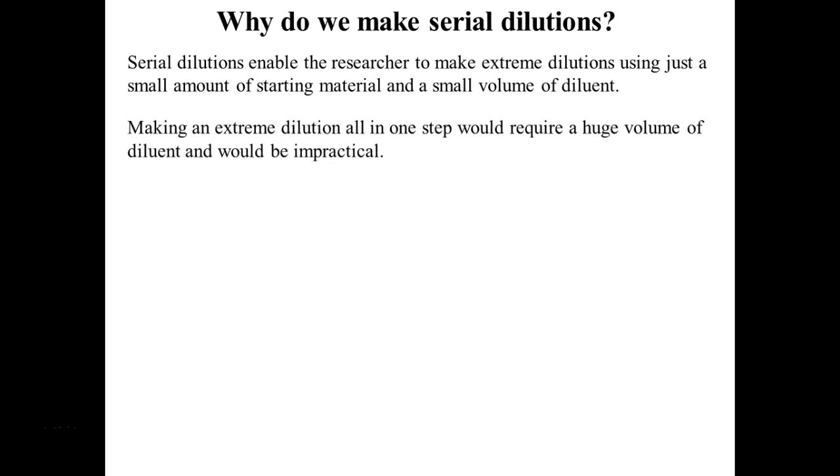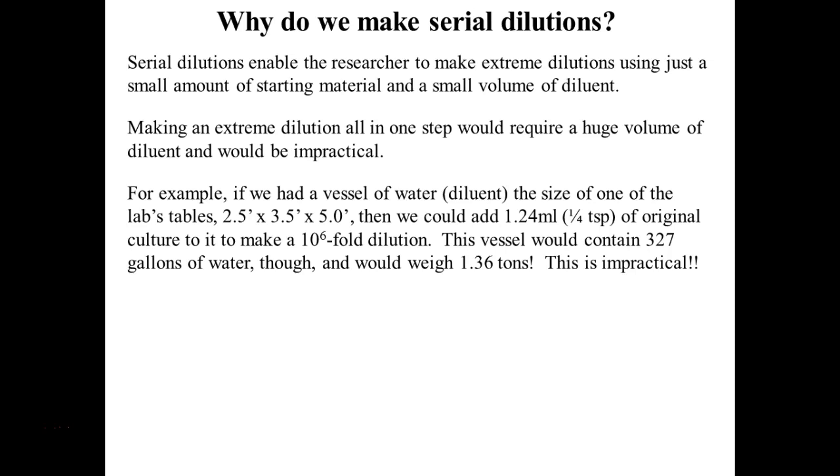So why do we make serial dilutions? So why did I do all that today? It's going to allow us to make extreme dilutions, right? I mean, I diluted, what was the final number? I can't even remember. I was diluting almost 1,000,000 times, right, from my original sample. If I was to do that into a large sample, it just wouldn't be practical.